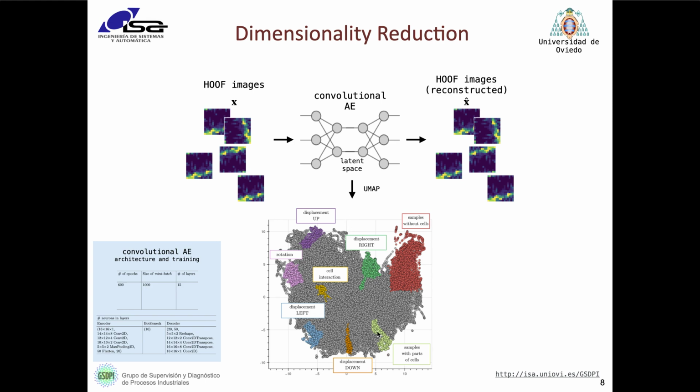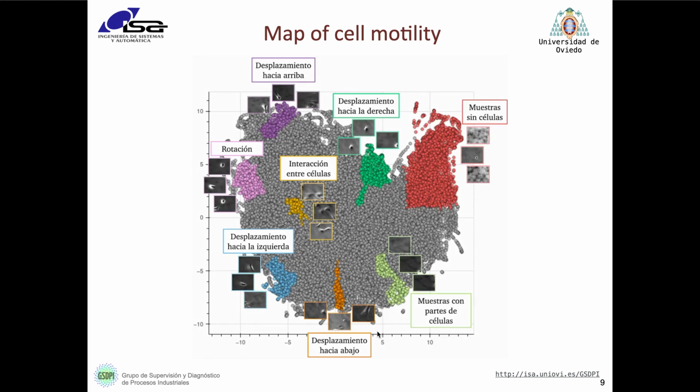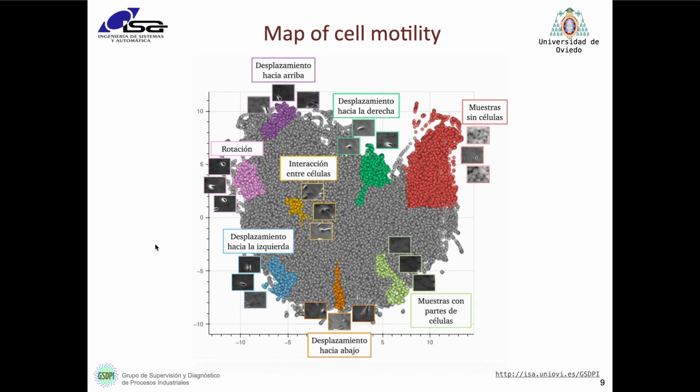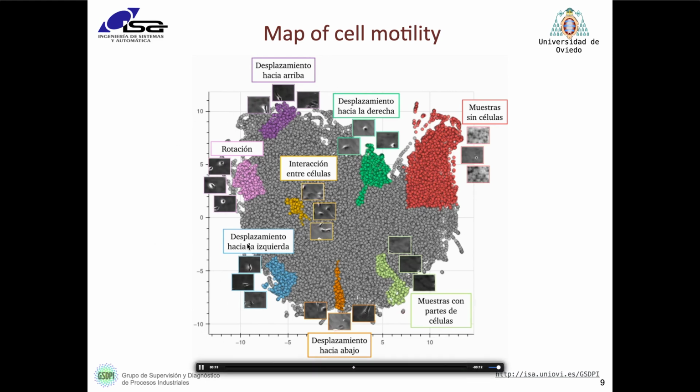We show a detail of the latent space showing some selected videos and how their location in the latent space is meaningfully related to their movement type. This is an encouraging result, showing how cell movement can be efficiently characterized and visualized in meaningful ways on a 2D interface. This suggests further developments in VA tools relating cell movement with other domains such as gene expression data or clinical information that can reveal connections between domains.